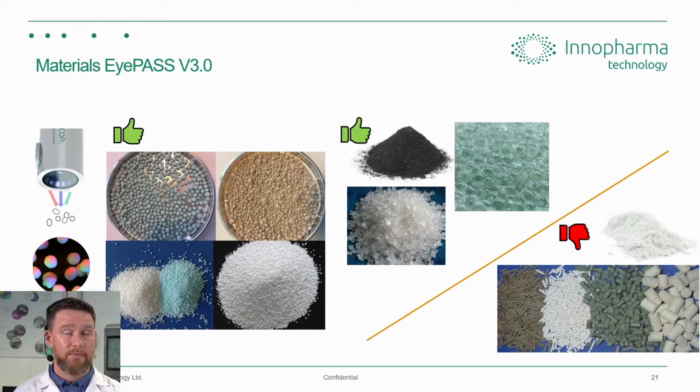So think of something like flour. It's not going to get any degree of separation when it's flowing. You can't measure it. And also materials that are outside the measuring capability of the instrument, such as materials of a pellet shape, where they can present either end-on, like a circle to the camera, or side-on, like a rectangle to the camera. Using the elliptical method in the background, it's not suitable for these types of materials.